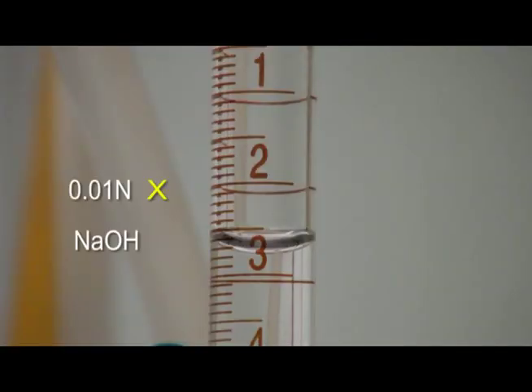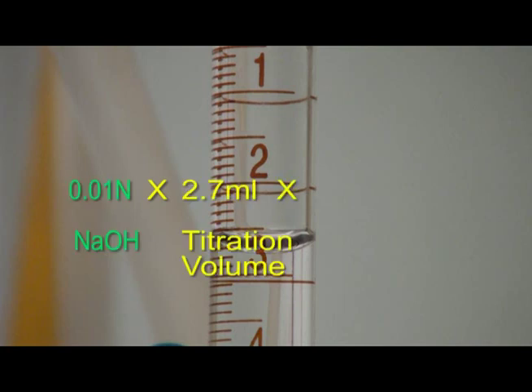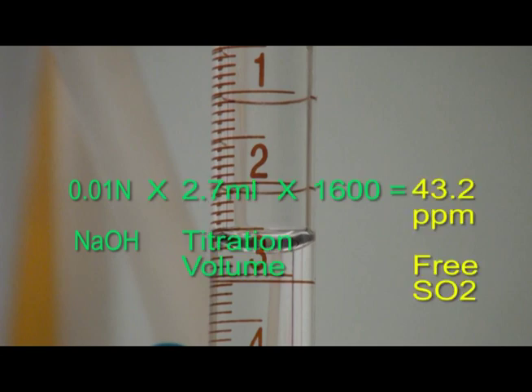To calculate the free SO2 in the sample, multiply the concentration of sodium hydroxide, in this case 0.01, times the mls dispensed from the burette and multiply the result by 1600. The result will be the free SO2 in parts per million.